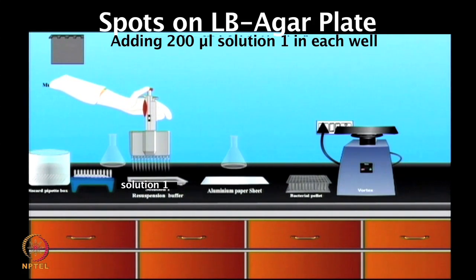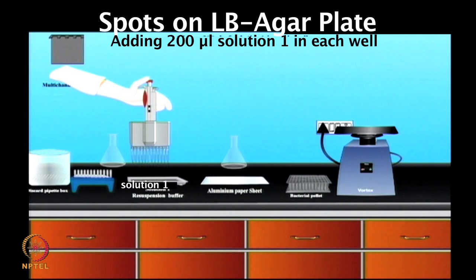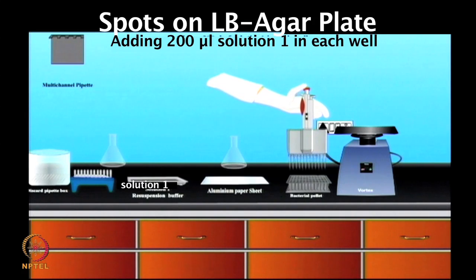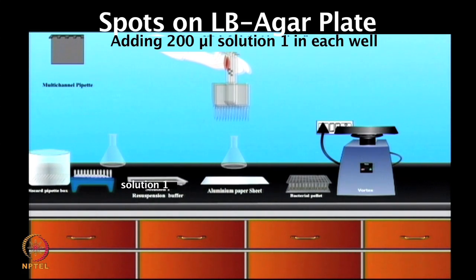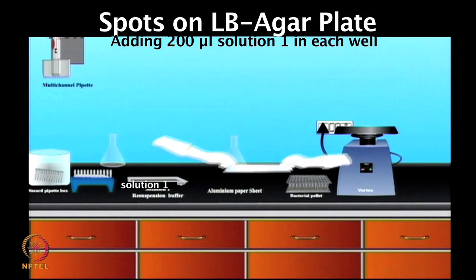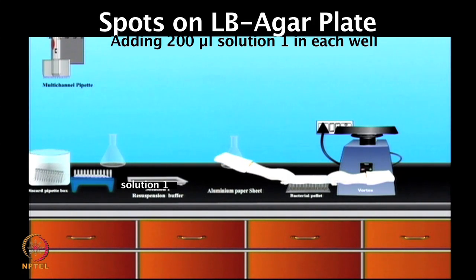You need to add the resuspension buffer, around 200 microliters, to each well. Remember, in the last step we had made the bacterial pellet from those culture blocks, and now you can add this 200 microliters of resuspension buffer in each well. After adding the solution, you can close the plate by adding a cover seal.